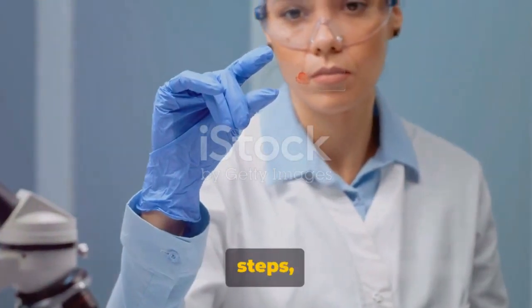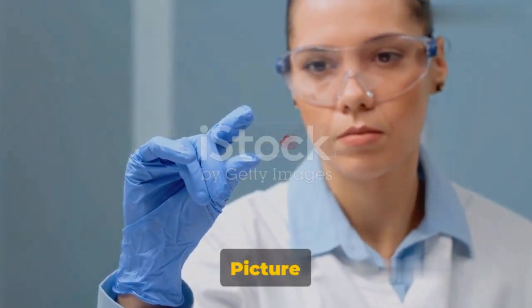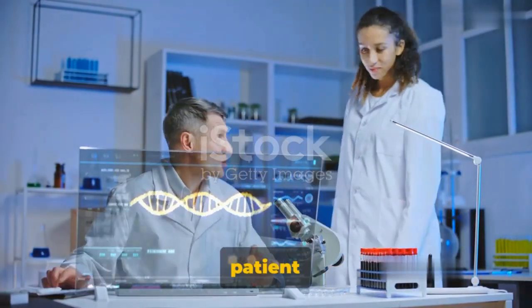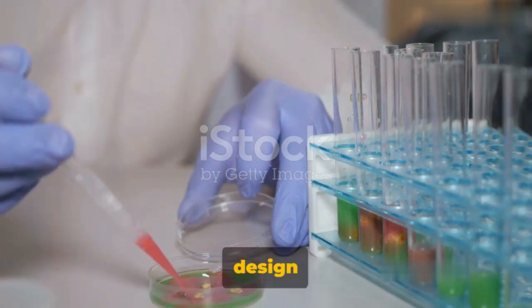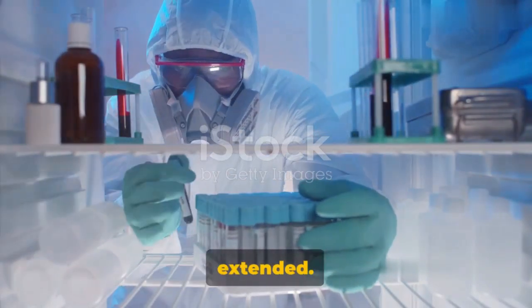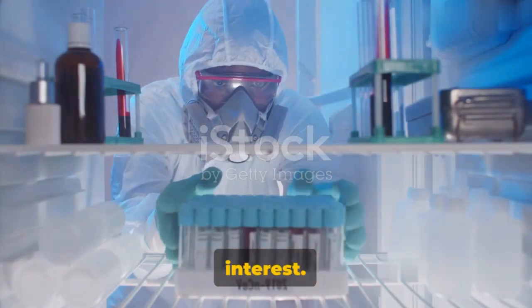Now that we've understood the steps, let's explore how real-time PCR works in a real-life scenario. Picture this. You're a genetic researcher studying a rare genetic disorder. You've identified a mutation that you believe could be the cause, and you need to confirm its presence in patient DNA samples. Here's where real-time PCR comes into play. You design specific primers for the mutated sequence and add them to the DNA samples. The amplification phase begins, where the DNA is denatured, annealed, and extended. This process repeats, amplifying the specific DNA sequence of interest.